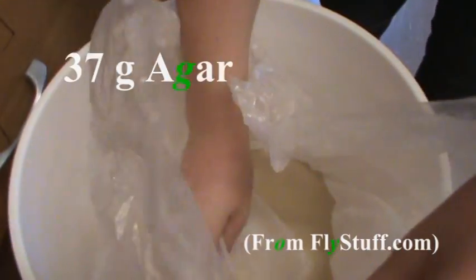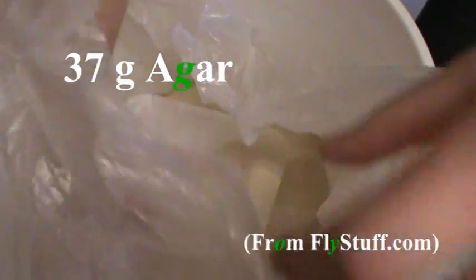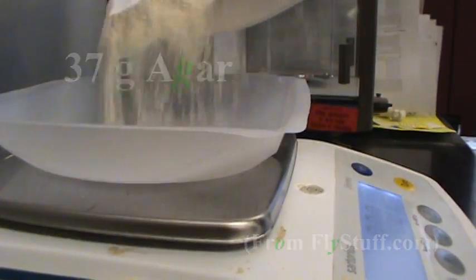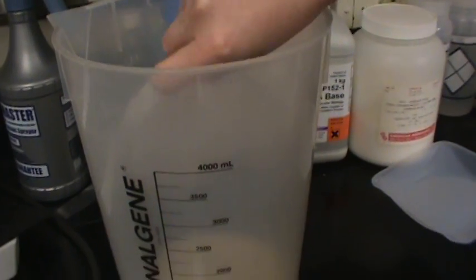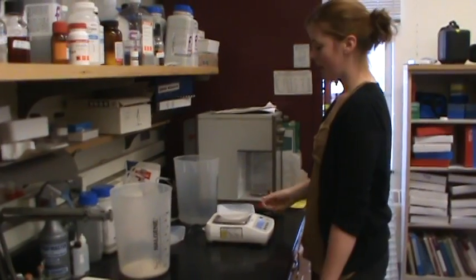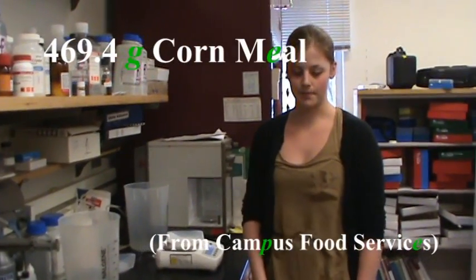In the first container there'll be 37 grams of agar. Now we're going to measure out 469.4 grams of cornmeal.